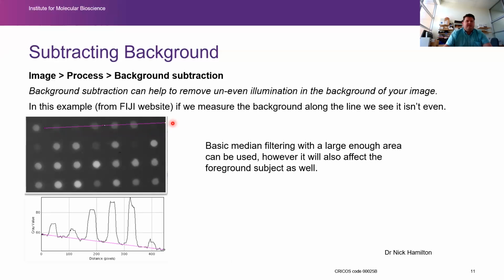And what we mean by that is if we take the example uneven background image, you have all these points of light, but you can see that it's darker over here and lighter over here. And so when we draw that line scan, you can clearly see the objects in it, or those disks, but the background changes.